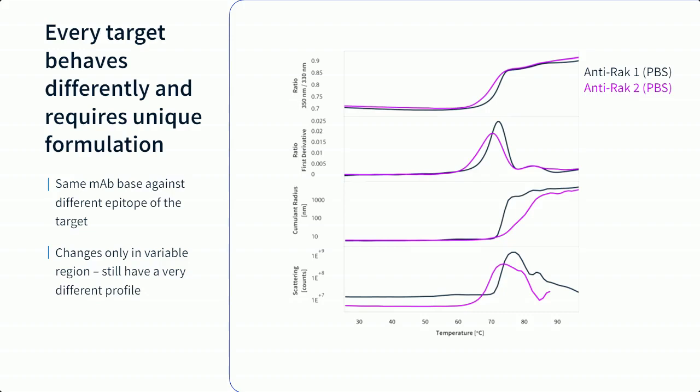This is just an example to serve as a reminder that the results from screens to optimize buffer formulations are very specific, and you'll need to tailor the formulation to each antibody.